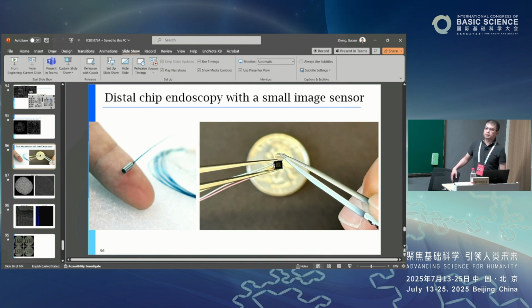The fundamental point here is we make a coded surface. That coded surface can modulate the light. Just like you have a very large angle light that carries the high frequency information, and by modulation with that coded surface, you convert it back to a small angle light.